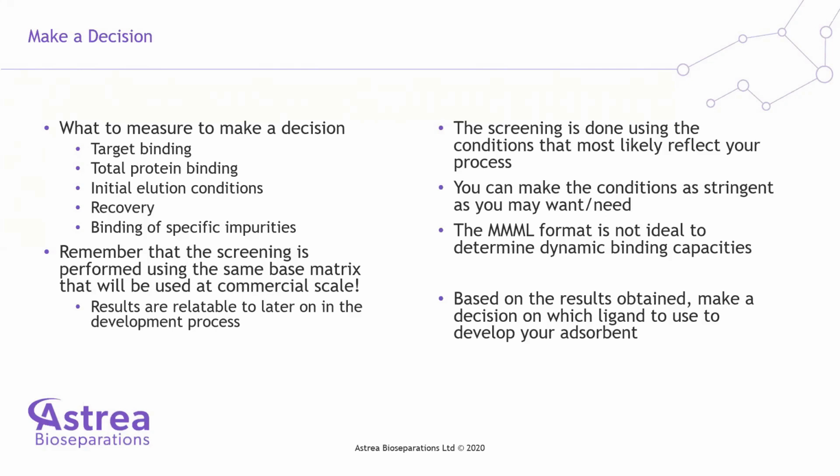You can look at recovery as well, although you have to be careful with this because there's a limited amount of material that you can practically pass through the microcolumns. And also, of course, you can look at the binding of specific impurities that you don't desire, and you can use that as a parameter for decision making as well.